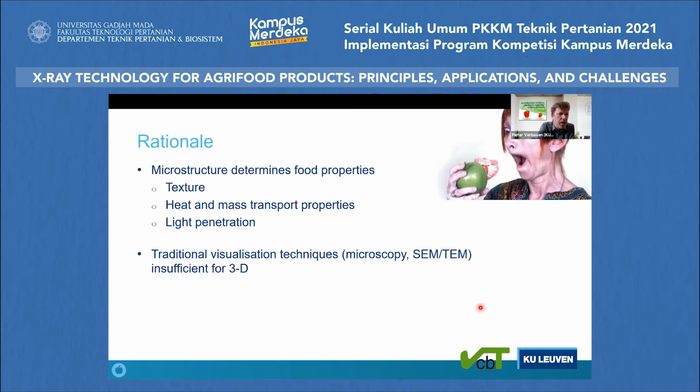A second rationale of looking at more advanced technology like X-ray technology is that, of course, you could say you're interested in porosity and structure of the products. Why not use conventional visualization techniques? They are very well established. Microscopy techniques, light microscopy or electron microscopy, are already a little bit more fancy. But all of these technologies need a lot of sample preparation. And their main limitation actually is that you cannot get 3D information from them.